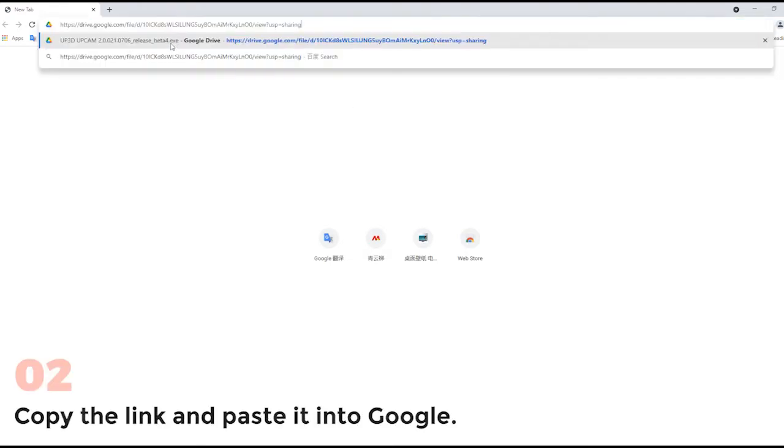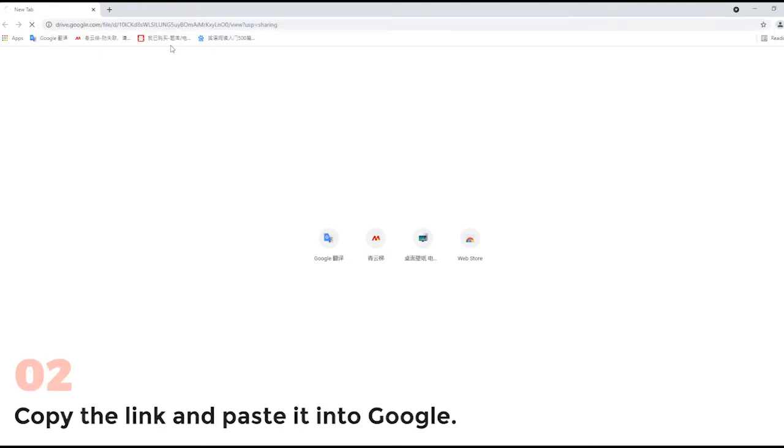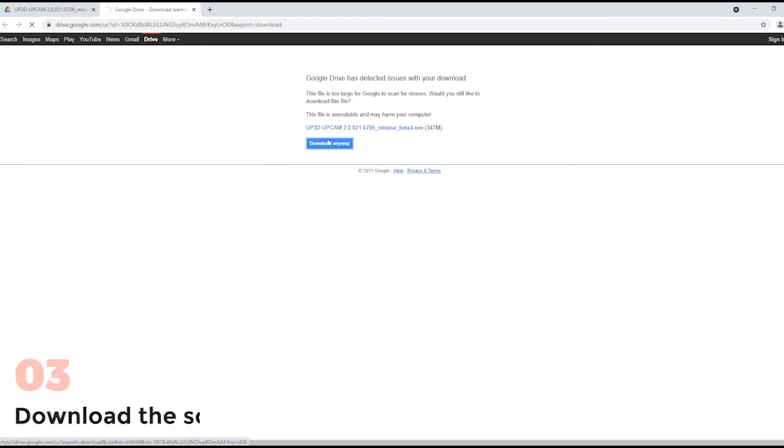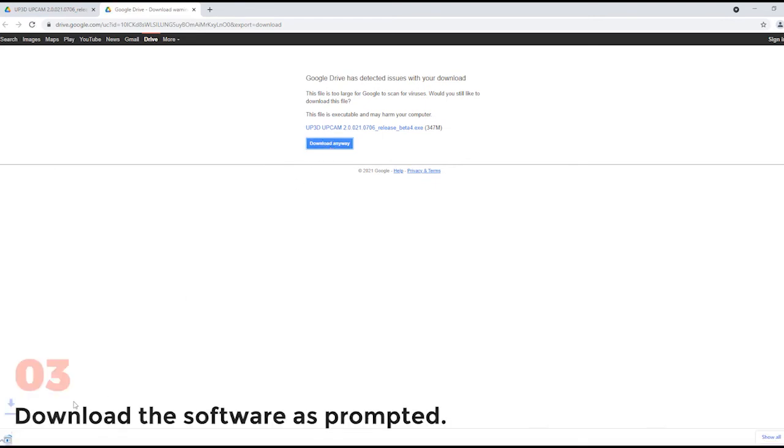Copy the link and paste it into Google. Download the software as prompted.